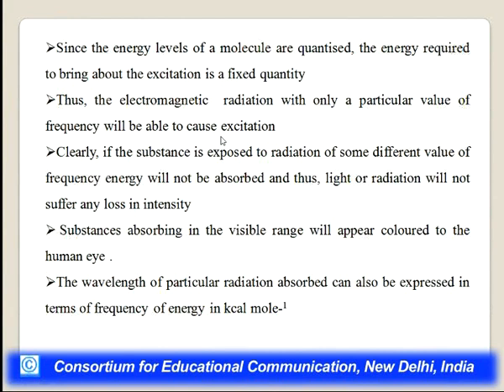It is not that all kinds of energy will induce the excitation. Only a particular value of frequency will induce the excitation. Clearly, if the molecule is exposed to radiation of some different value of frequency, energy will not be absorbed, thus the light or radiation will not suffer any loss in intensity.